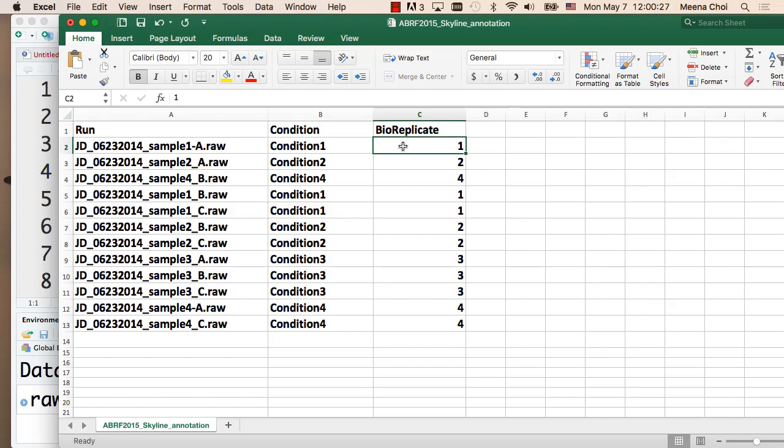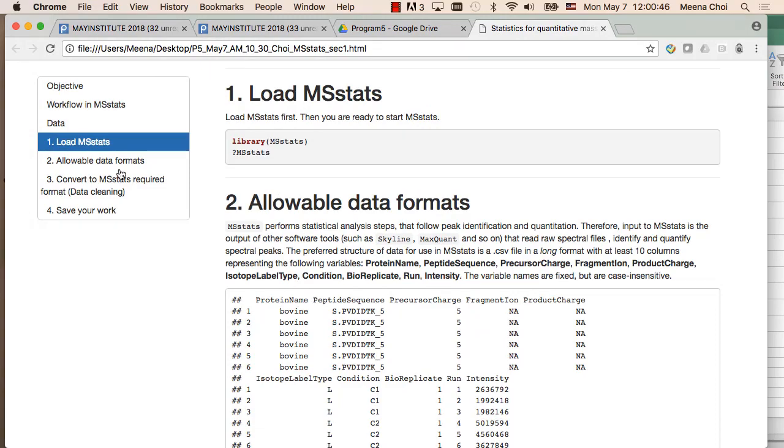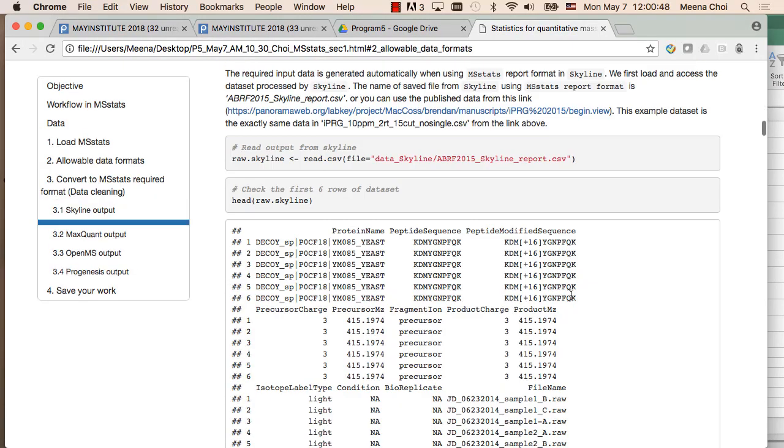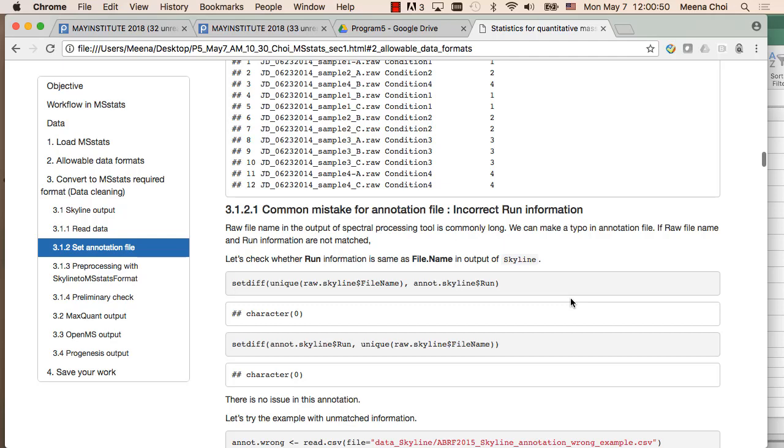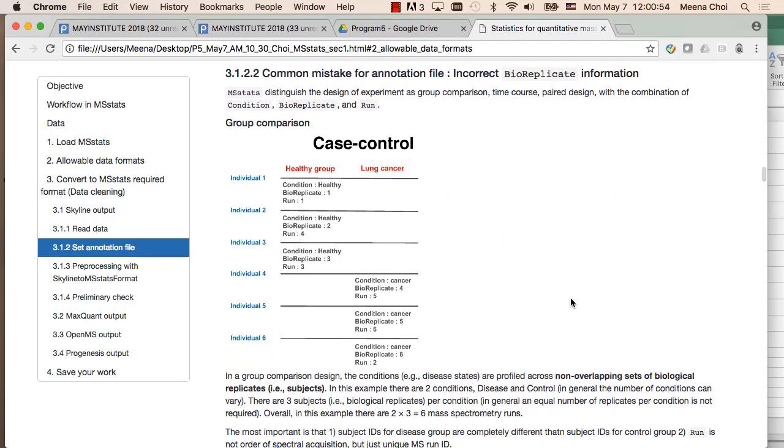I thought this was quite simple, but I realized 99% of people make a mistake in this part, and if you make a mistake, the result is actually different. So I decided to discuss this a little more than before. Let's see this one.